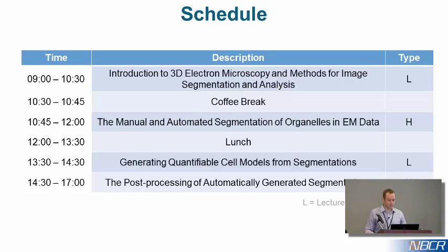So I'll start. I started as a graduate student working with electron tomography, using computational techniques to reconstruct volumes with a much finer resolution than what we're discussing here. Then about halfway through my PhD, I transitioned into looking at serial block face volumes, which are gigantic data sets that cover a large range, but with a somewhat coarser resolution. And then I quickly found out that segmentation was a huge problem. Getting quantitative results out of those data sets was extremely difficult.